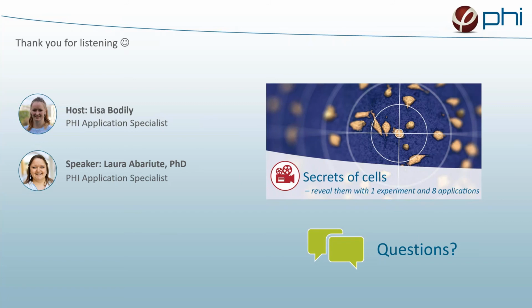Next up, we have Jamie from Australia. How did you add the colors, Laura? Thank you, Jamie, for the question. I guess it's a bit confusing because we show all these colorful images and we say that it's a label-free method. All the colors are actually added inside the software after you are done imaging. We have a very broad color palette where you can choose whatever colors you dream of. And all the colors are added to correspond to the cell thickness.